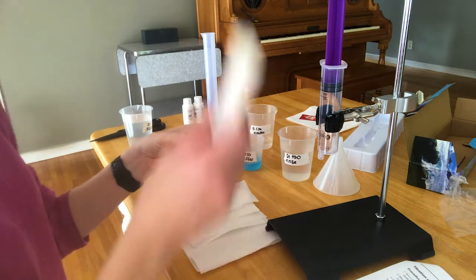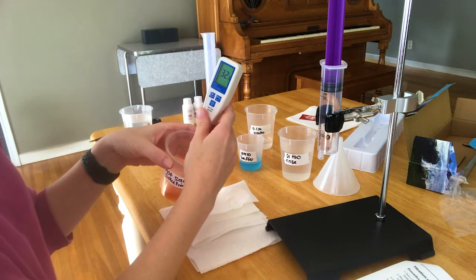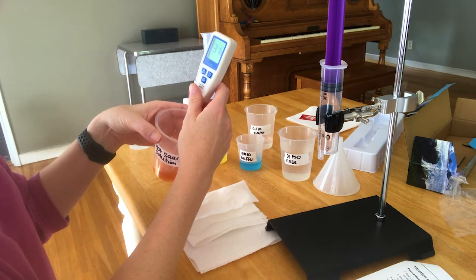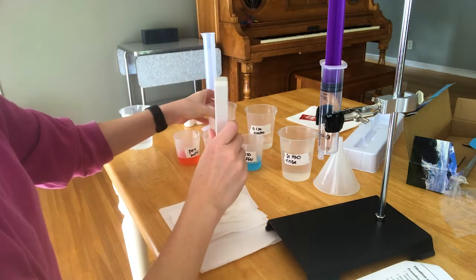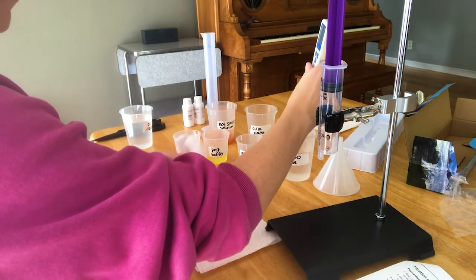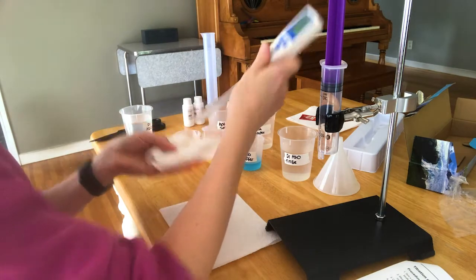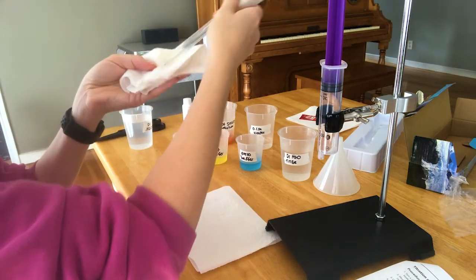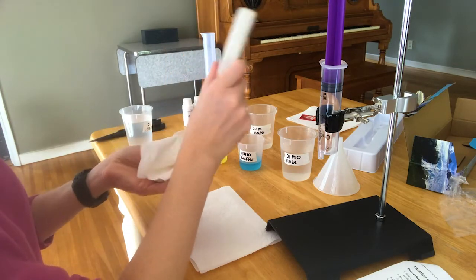Then do the same thing with your hot sauce solution. Just wait a second for it to stabilize. Your pH might be different because mine is more concentrated than yours will be. It really smells like a toxic concoction, so you probably want to have good ventilation so that you're not tempted to sneeze.